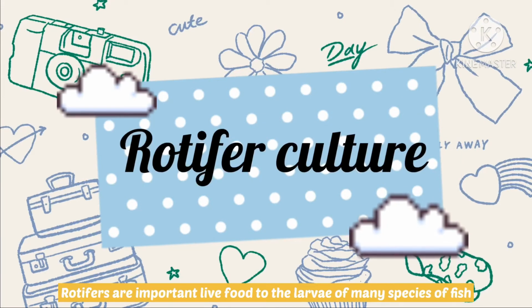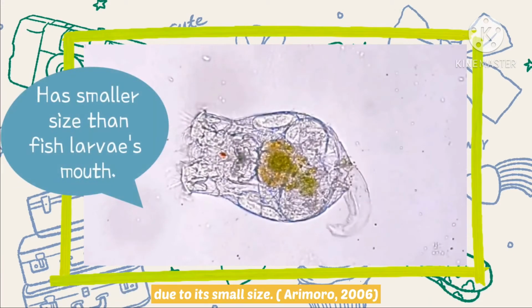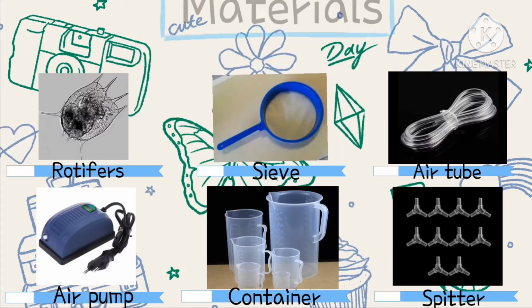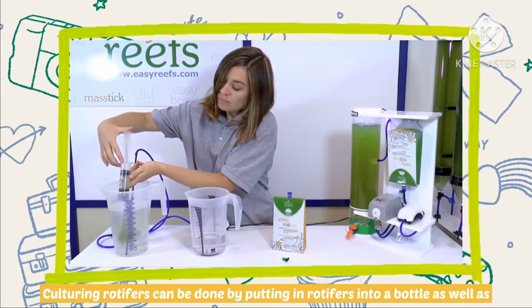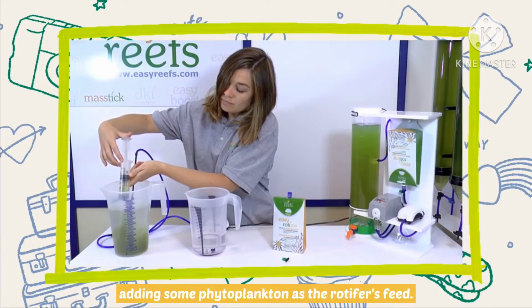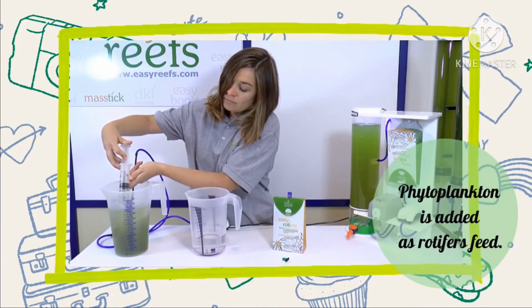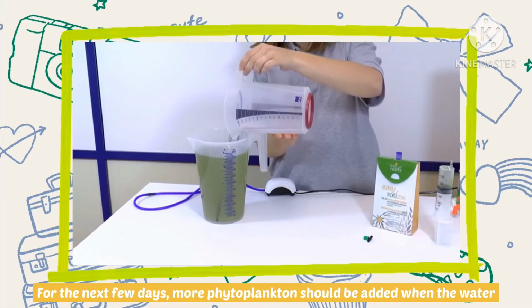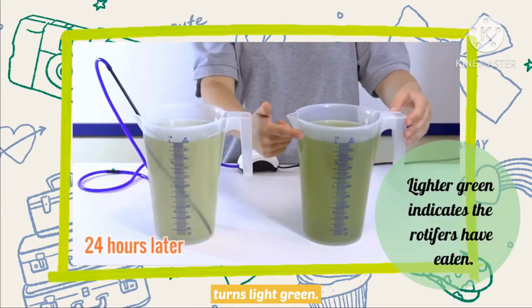Rotifers are important live food to the larvae of many species of fish due to its small size. Culturing rotifers can be done by putting rotifers into a bottle as well as adding some phytoplankton as the rotifers feed. For the next few days, more phytoplankton should be added when the water turns light green.